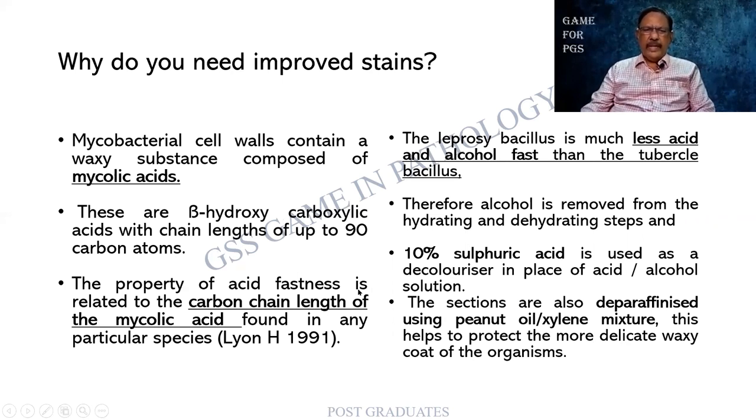The property of acid fastness is related to the length of the mycolic acid that is found. So since leprobacillus contains it, the same conventional method will not be that effective. In fact, the stain is said to be lost after some time. Hence, an improvement is needed.